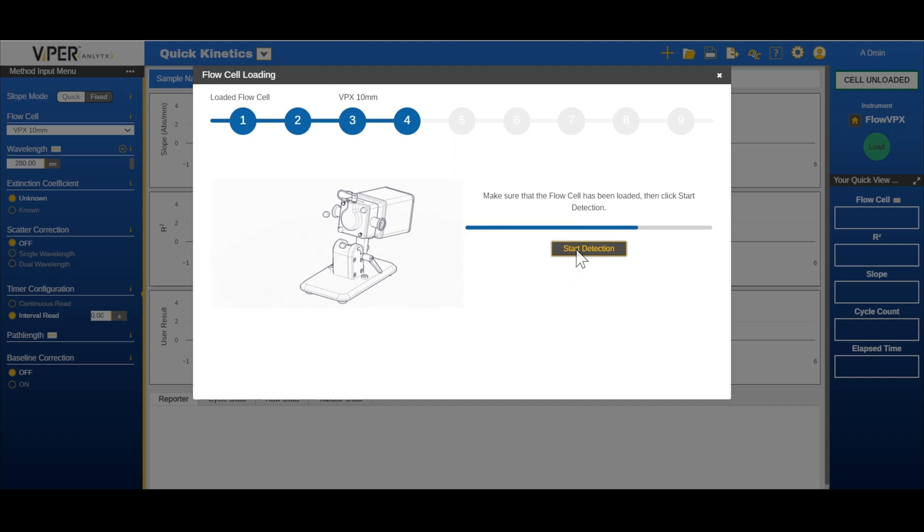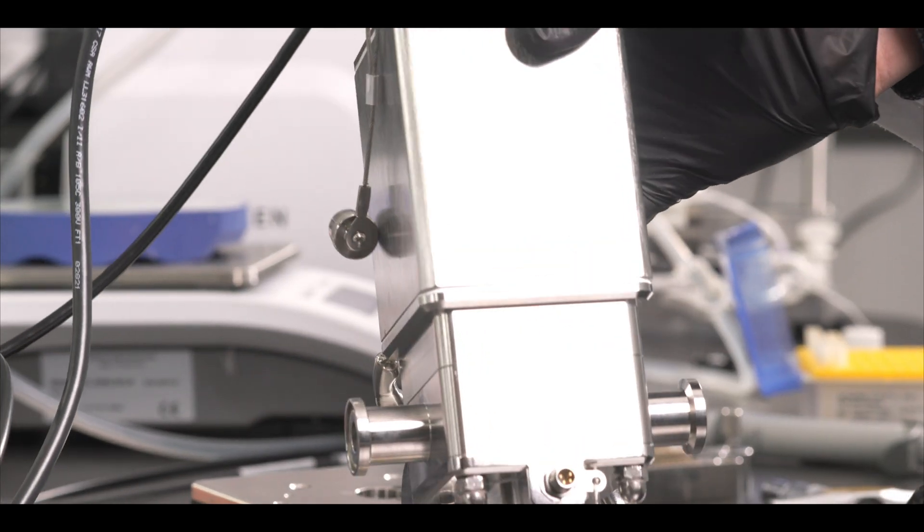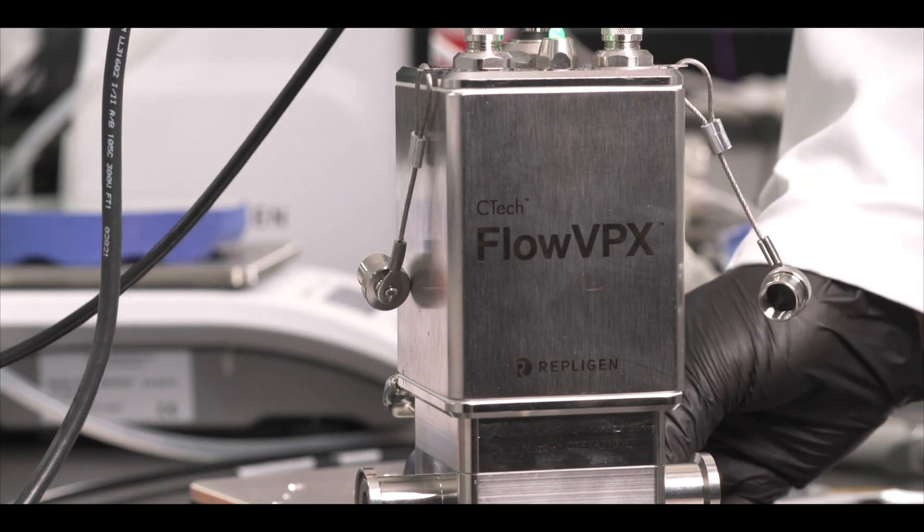In the software, click start detection. Wait for the software to detect the flow cell. Then click next step. Return the FlowVPX to the upright position. Tighten the mounting post clamp handle.